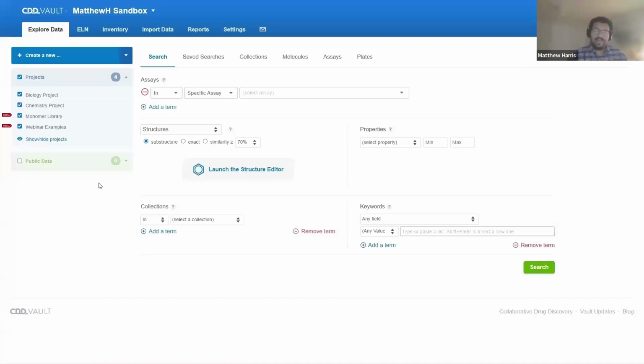Hello, everyone, and welcome to our Q3 quarterly webinar update. My name is Matthew Harris, and I'm a customer engagement scientist here with CDD Vault. Today, I'll be reviewing some of our exciting updates to our macromolecule editor and some of our new registration capabilities surrounding cyclic peptides, antibodies, and antibody drug conjugates.